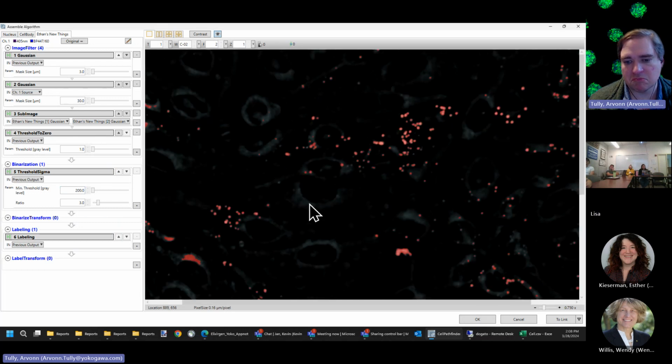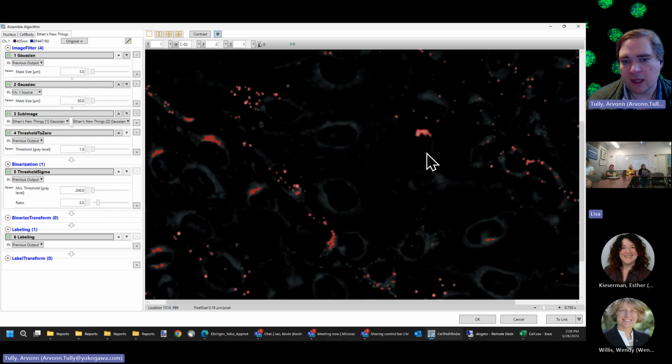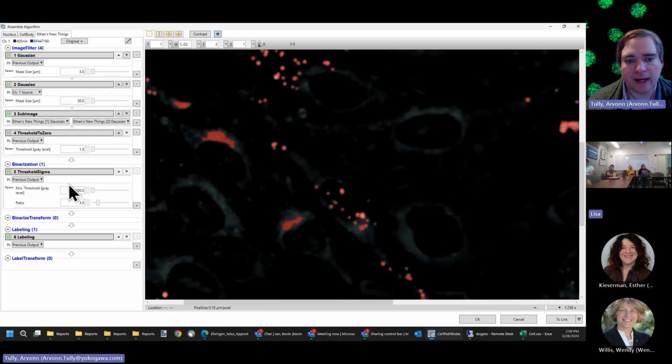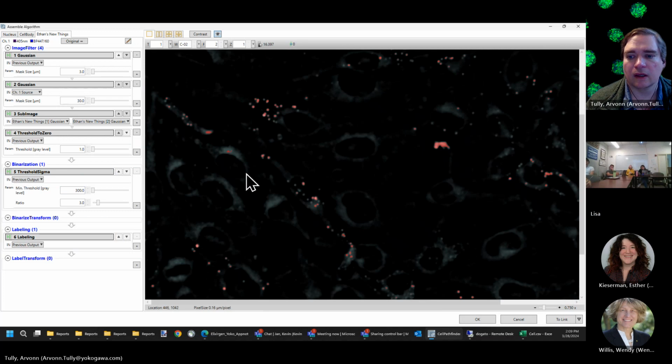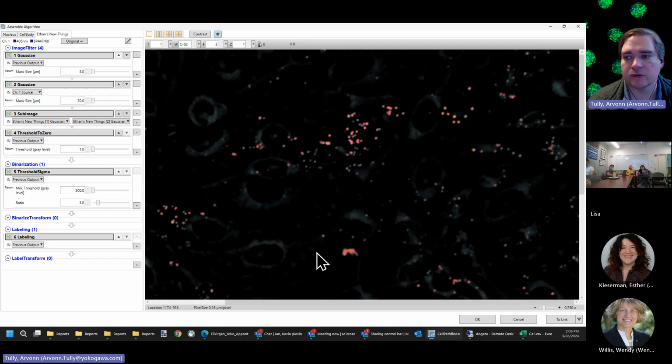So that's actually pretty darn good. Now if I want to split these apart, I could also make this a little bit higher. I'm going to make this a little bit higher. I want to really just pick out the bright ones. Yeah, that's pretty good. That's really good.